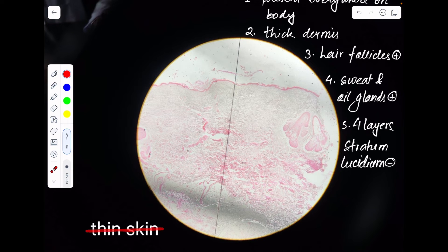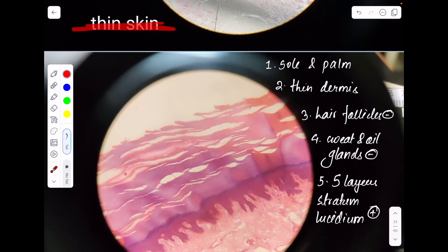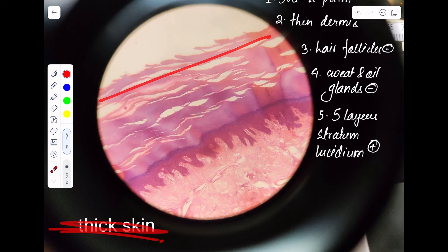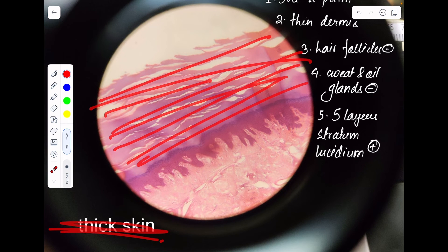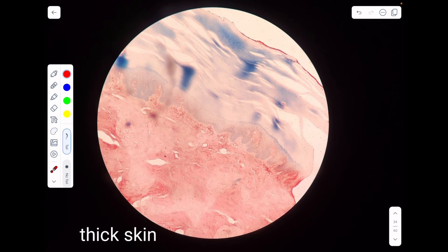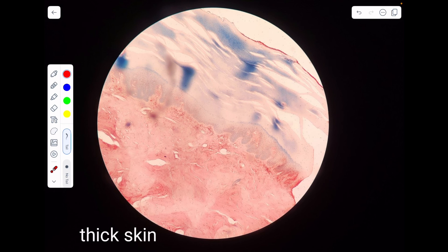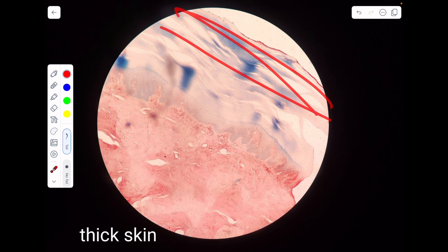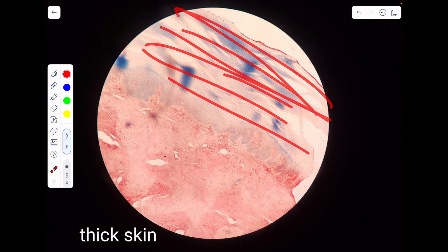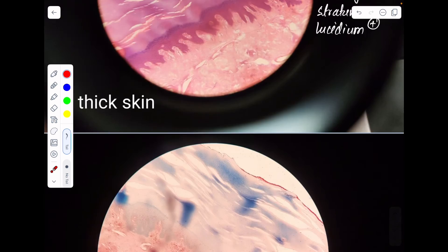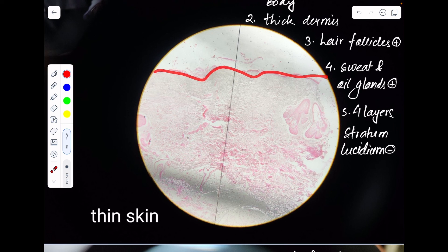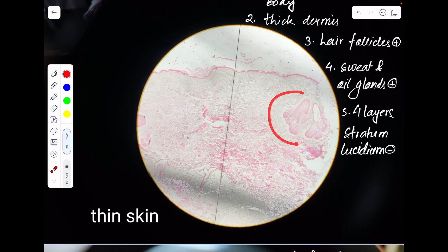Histologically, the best way to identify thin skin is by looking at the keratin layer. In thin skin there is a thin deposition of keratin outside the skin; however, in thick skin there is a much thicker, laminated deposition of keratin. You can see in this histological slide — this is thick skin and there is a huge deposition of keratin outside the skin. So if you are confused differentiating thick skin from thin skin, just look at the keratin layer: if there is a thick, highly laminated deposition, it's thick skin; if there is a thin deposition, it's thin skin.